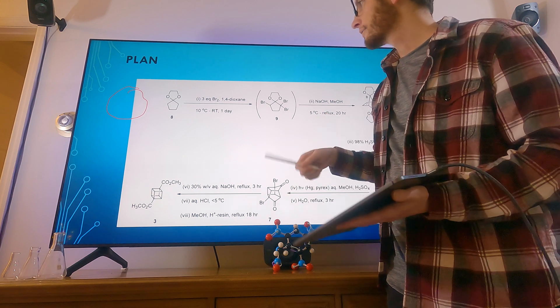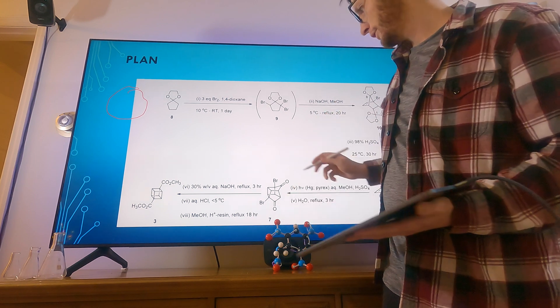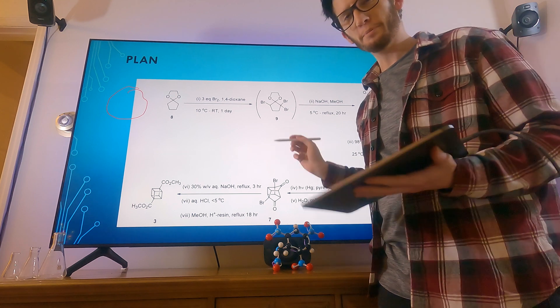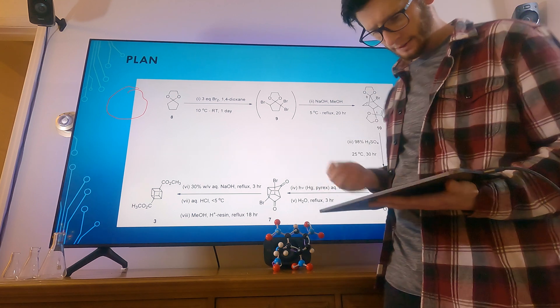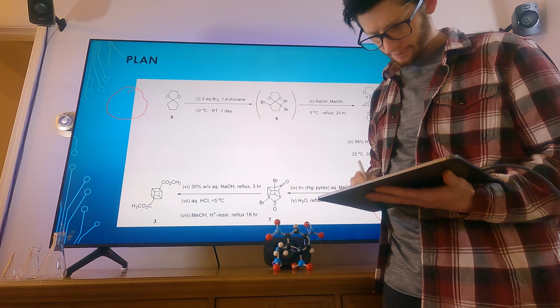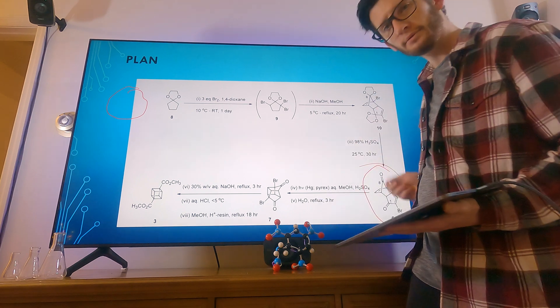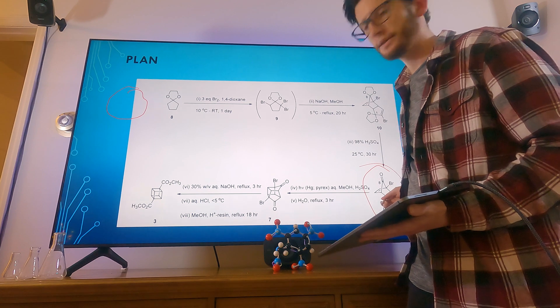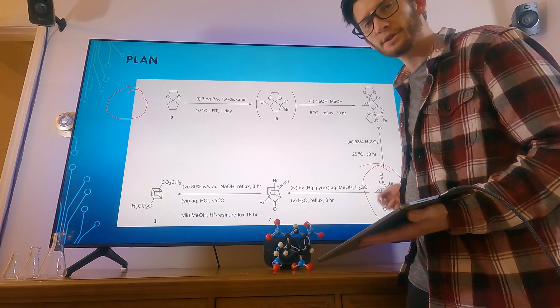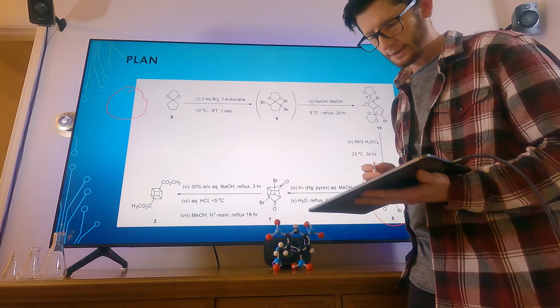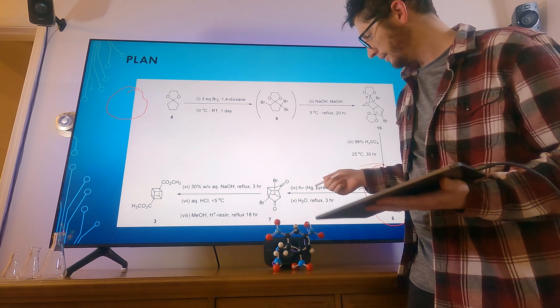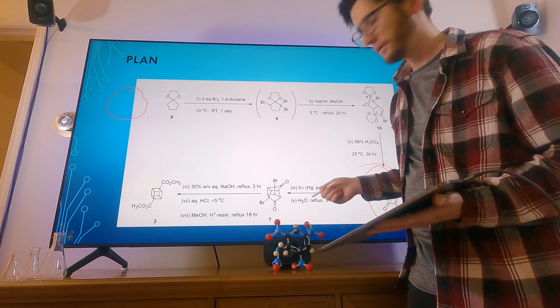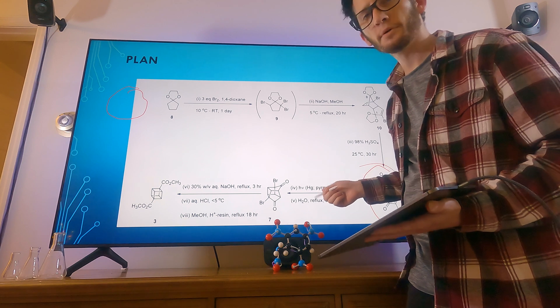There was very limited amounts of information for home chemists past this point right here. So, well, I have very good confidence that we will get to this point, but the ultraviolet step is going to be a little bit difficult.